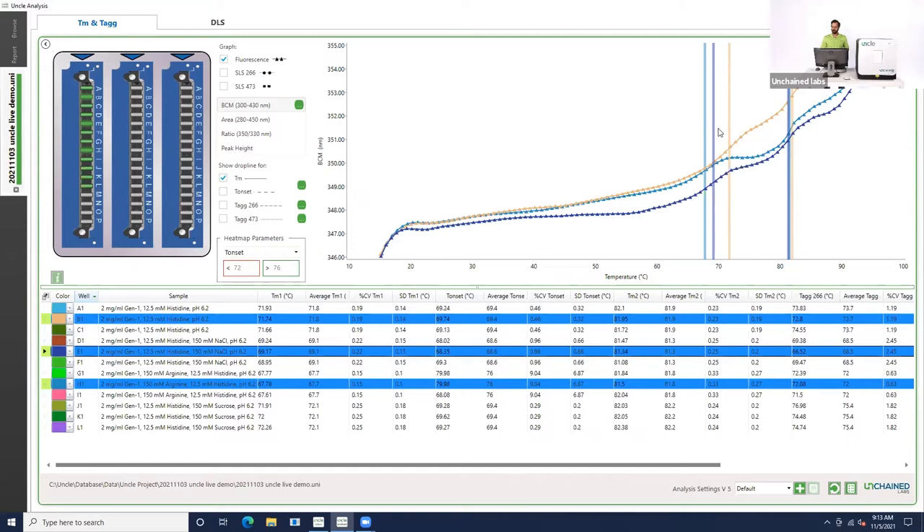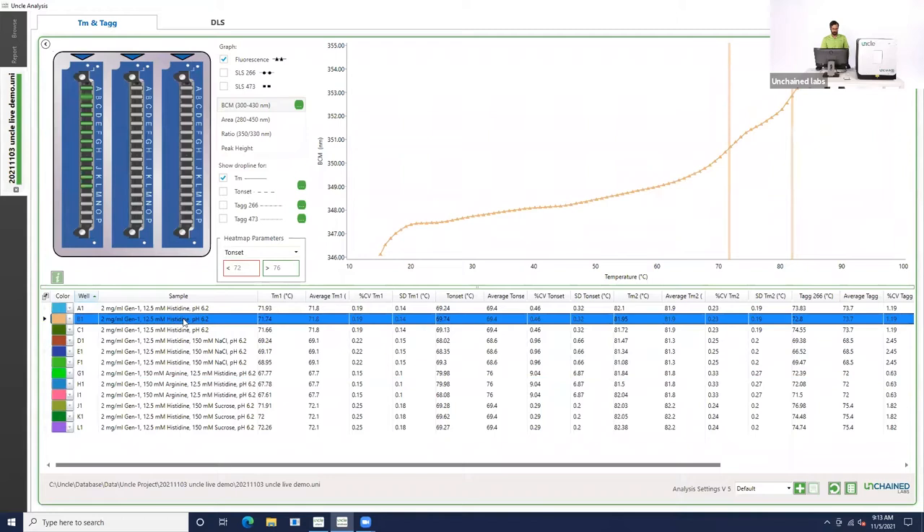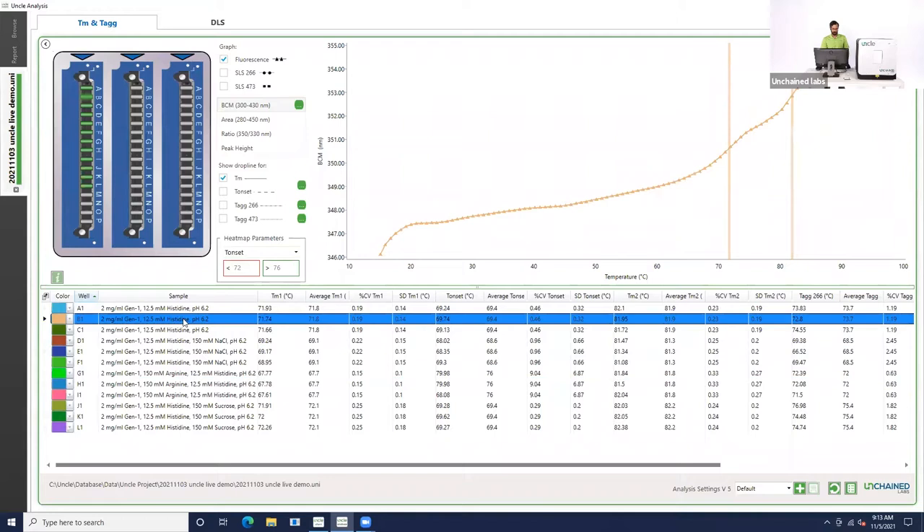Now that we've looked at conformational stability, let's look at colloidal stability — basically looking for aggregation. We'll go back to the histidine sample alone, now turn on our static light scattering, our SLS of the 266 laser, and also turn on the TAG 266 drop line. You can see the SLS is kind of a gradual sweep rather than a sudden increase in fluorescence, so this is aggregating a little more slowly. And you can also see that aggregation kind of starts at about the same time as TM1 is starting to happen — that initial unfolding behavior is really closely connected with the onset of aggregation. So those two events are most likely linked.